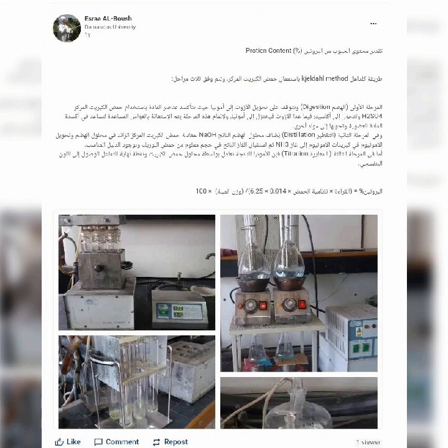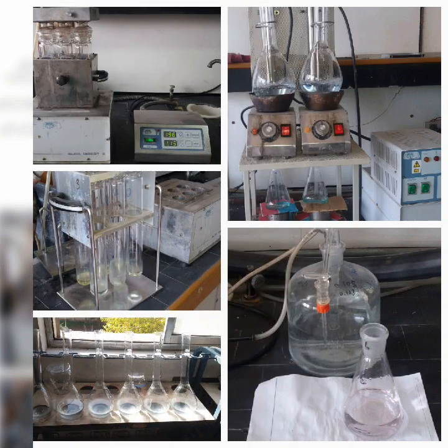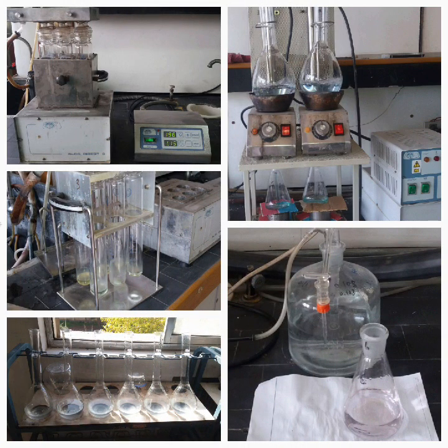In food science, we use a chemical approach that targets nitrogen since proteins are rich in nitrogen atoms. This is where the famous Kjeldahl method steps in. Think of it like using a detective's toolkit. We're tracking down nitrogen, converting it into a measurable form, and then calculating how much protein must be present. By the end of this episode, you'll see how a series of clever reactions, some bubbling chemistry, and a dash of math unveil the hidden protein inside every grain.